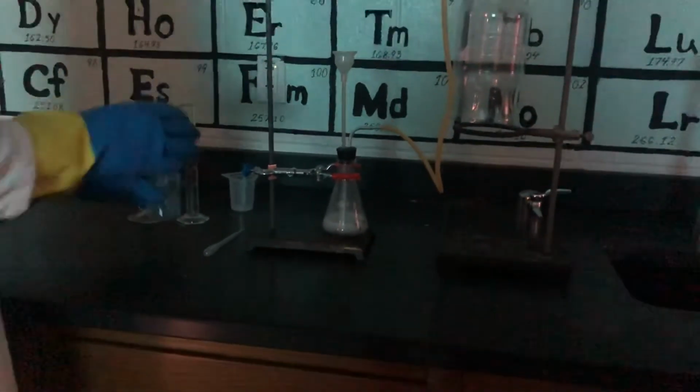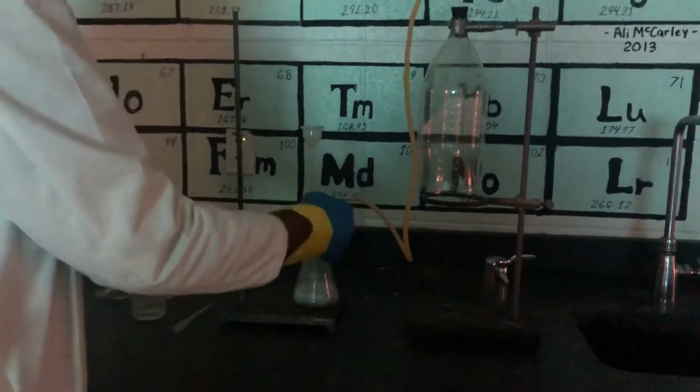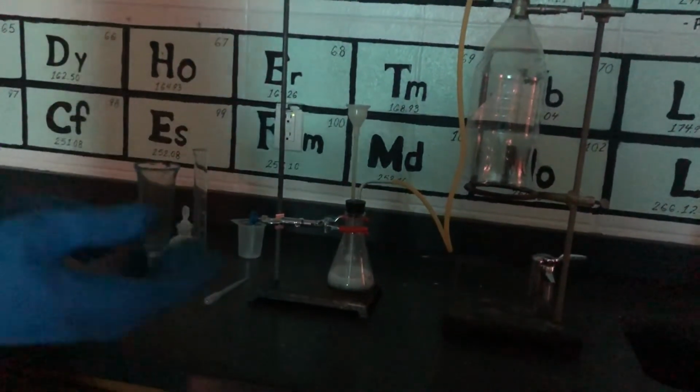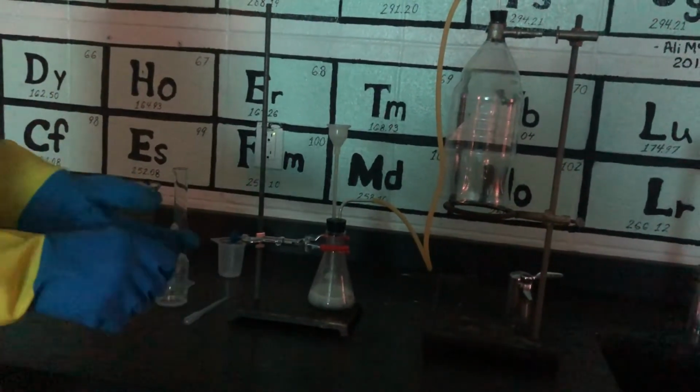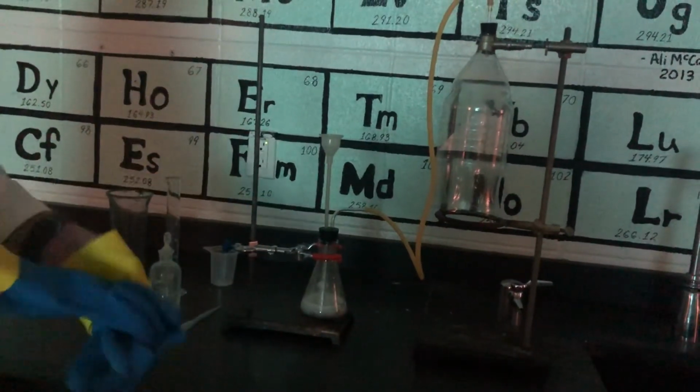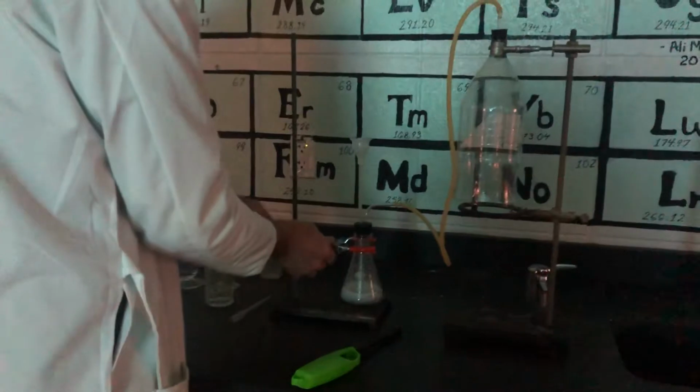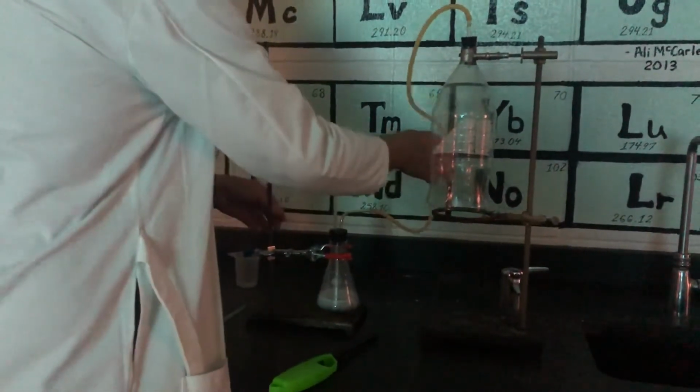Now, if you were interested, what I was doing a moment ago, that's the bend I made previously. As you can see, it goes through the 2-hole stopper for the delivery tube to go into this. Now the next step is, if we have enough hydrogen present, I'm going to remove these gloves because I try not to have gloves on when there's flame present. I'm predicting there's going to be a flame, so I want to move this around just a little bit, get this piece of tubing out of the way.